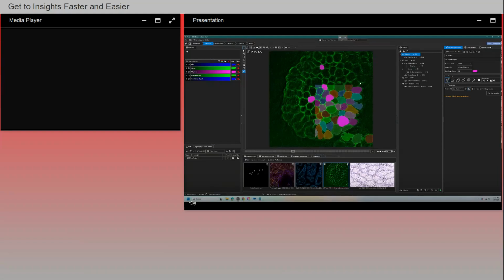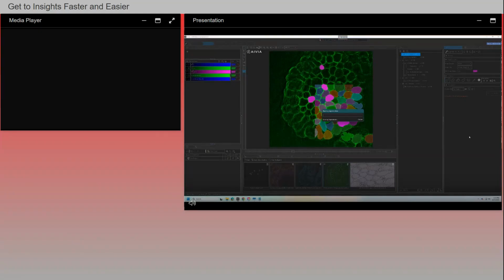I am happy with it. This looks really good. Notice I painted 5 cells on a single plane. I'm going to run the segmentation to see how well the 3D mesh creation worked in this example.